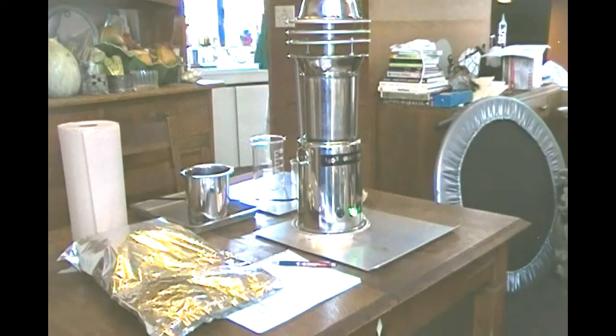If you run it for 12 hours, as it's sitting now, you'll get probably 95% of every soluble element that's in there. If you run it for a whole day, for 24 hours, you can get 100% of the soluble elements. The way that you know when you've extracted everything is the plant material, first of all, turns the color of light brown straw. And then the second test that you do, you could see when I was holding the extraction basket above the processing vessel, that the solvent dripping out the bottom has some color to it. When that solvent drips completely clear, you know that it has washed out everything that is in the plant.